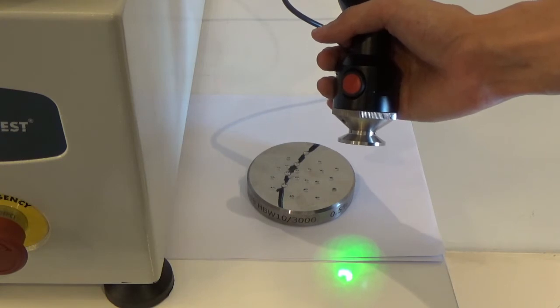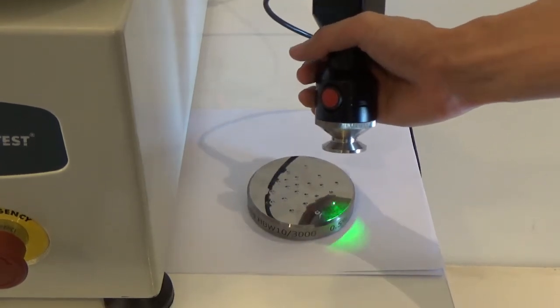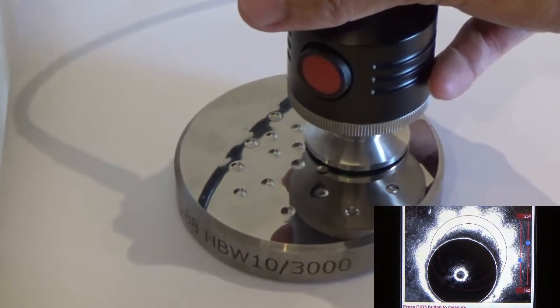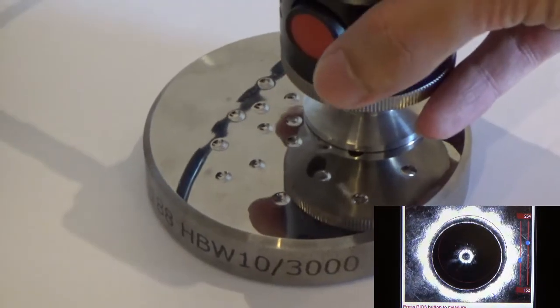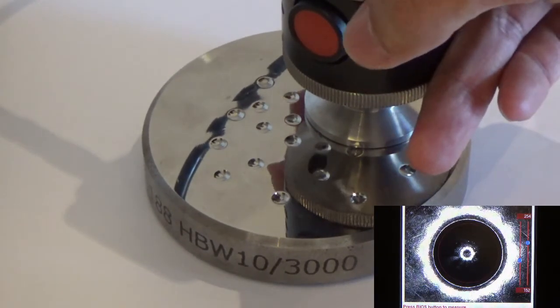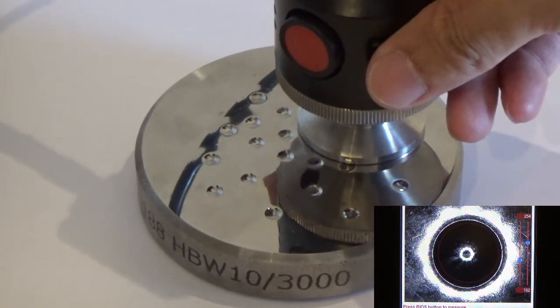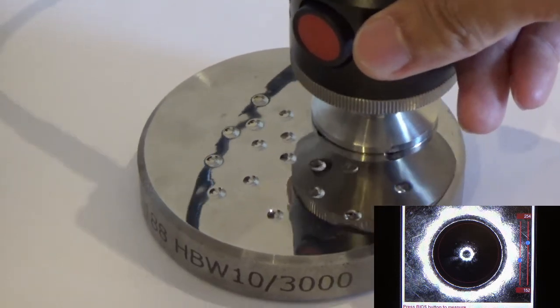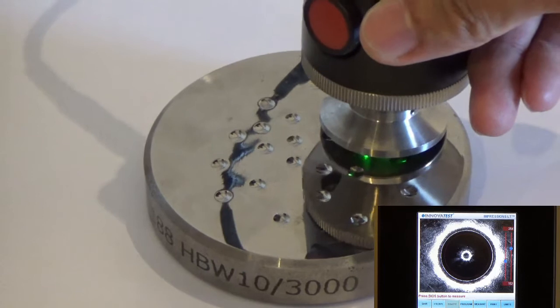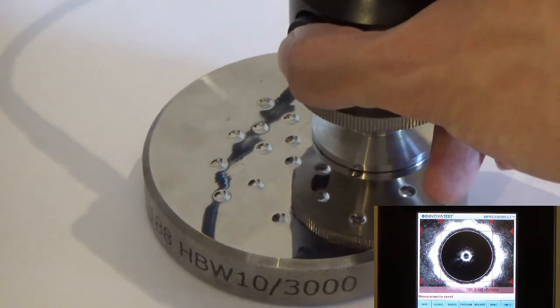Once the indent has been made, you can remove the sample from the sample stage and use the Brinell Indent Optical Scanner to measure the indentation. At the same time, you will be able to see the real-time image on the screen. Once you have located the indentation, you can press the red button to capture the image and the system will measure the diameter and give you the result.